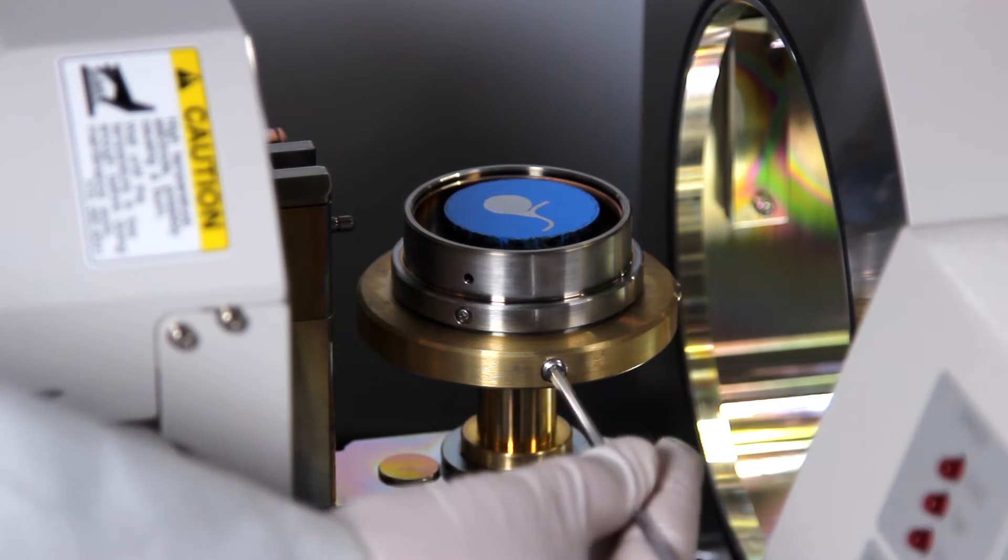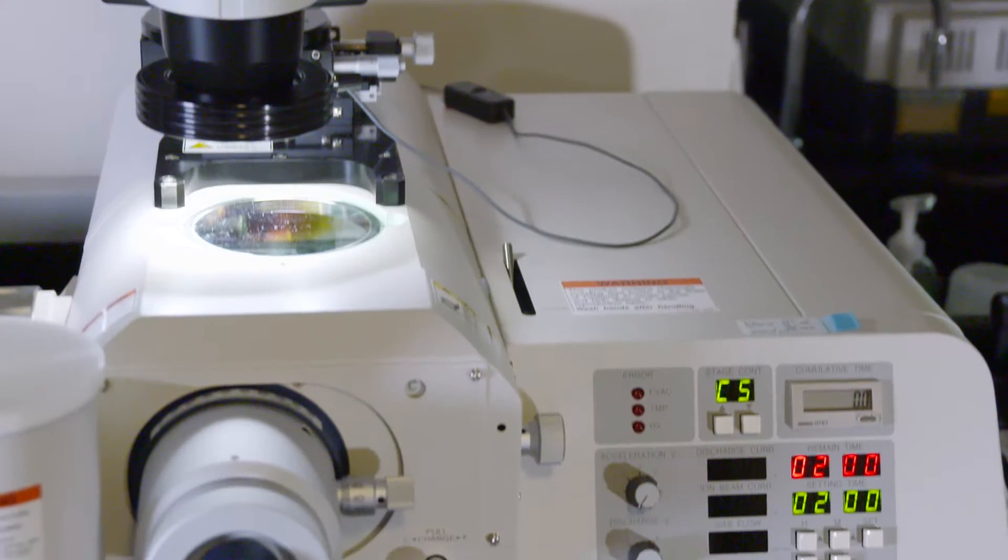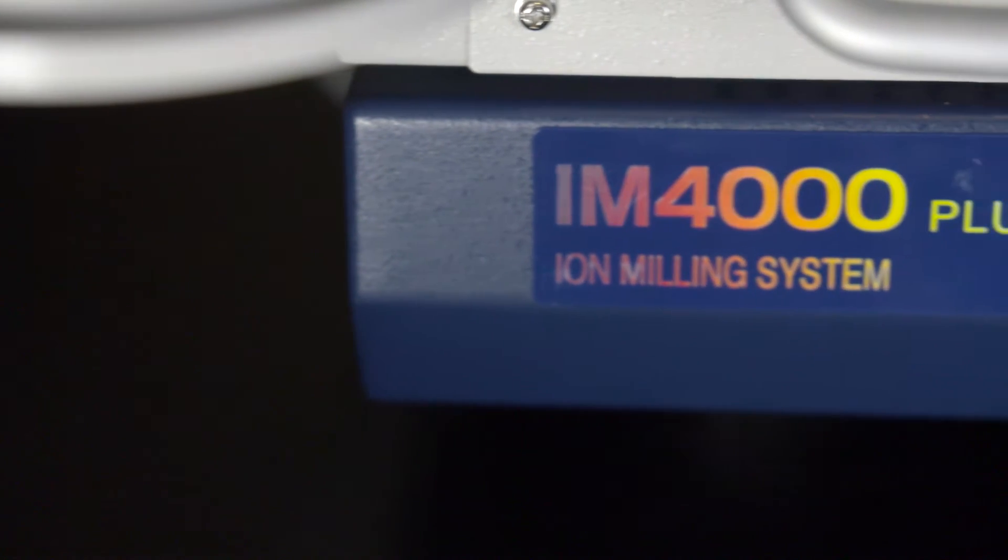The hybrid function of the IM4000 Plus combines both milling configurations in one machine to satisfy a wide variety of materials and their applications.